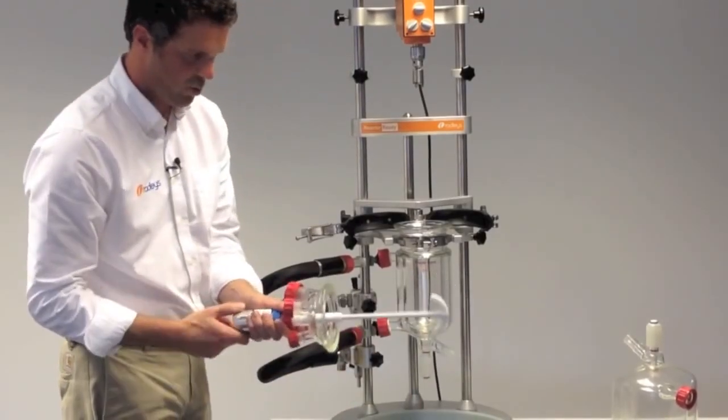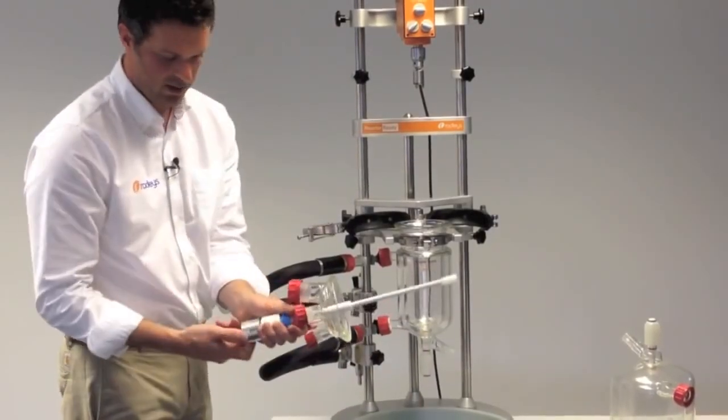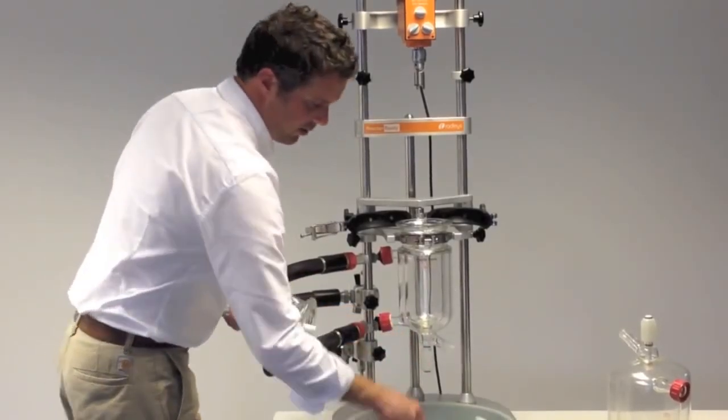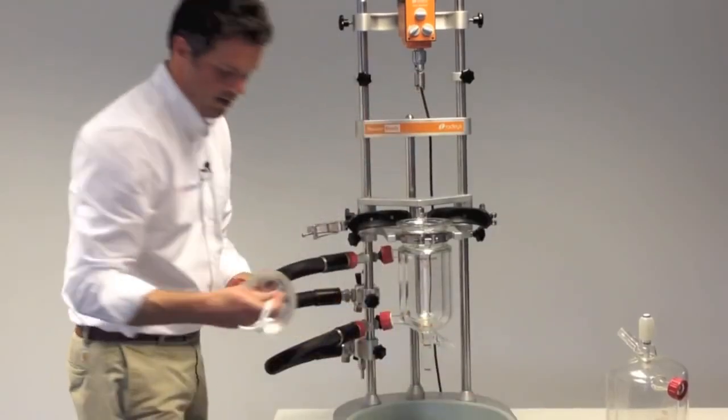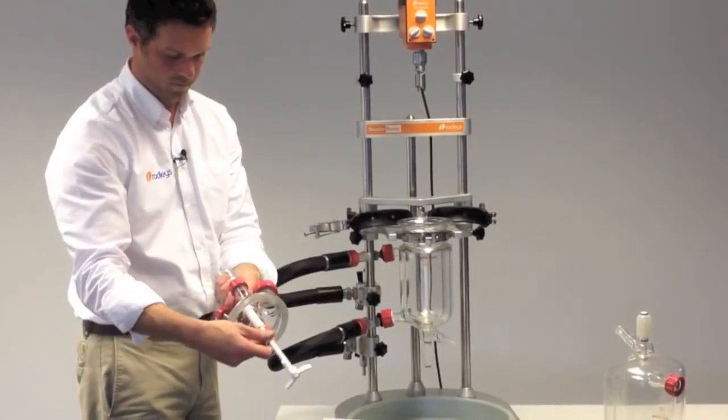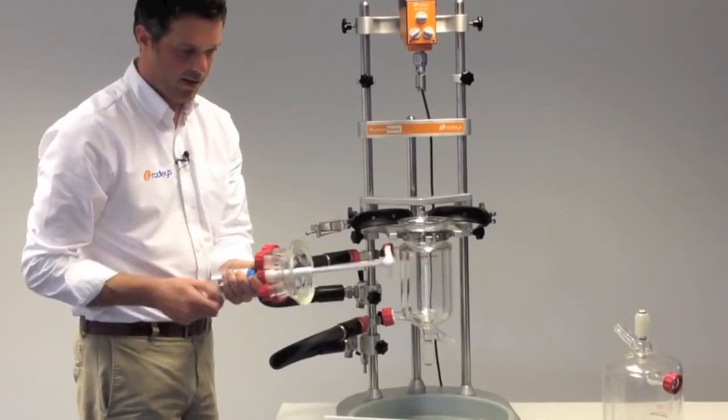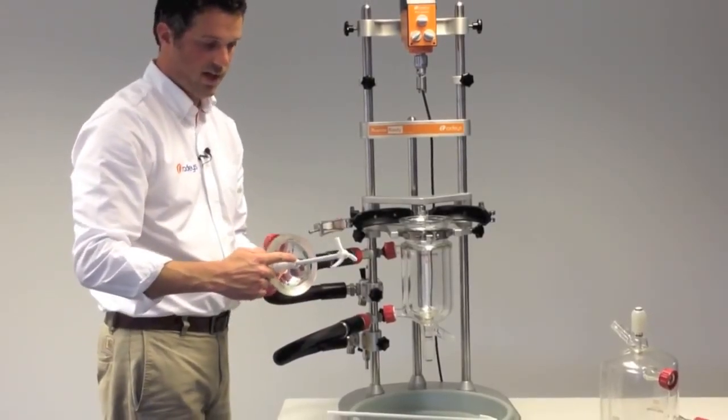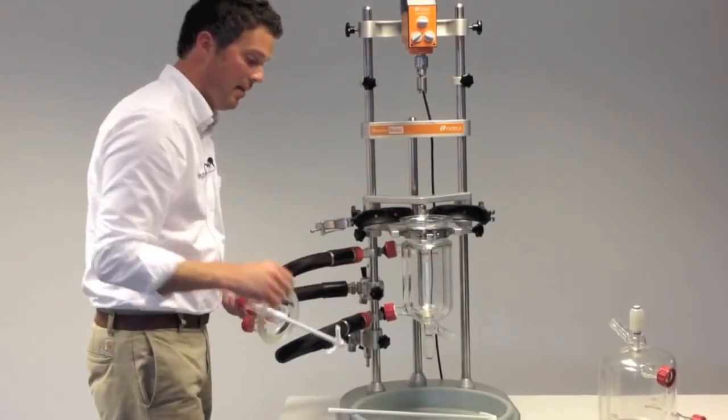I'll just change the stirrer for the smaller 1 liter size. You just undo the PTFE stirrer guide at the top and then you can slide in the new stirrer. The stirrer guide is extended in the bottom portion, which stops any whipping that you can sometimes get in the larger vessels.